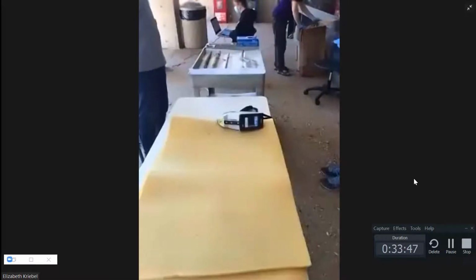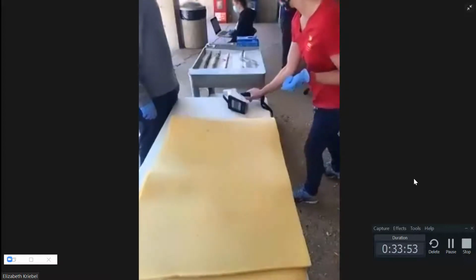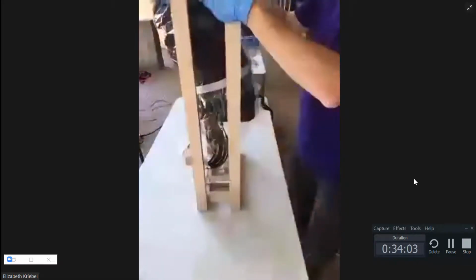Okay, this will be a bit more challenging because it is more fragile. And it's mounted. It's going to be complicated, isn't it? Yeah. So I think we can let go of this. We also don't want to leave this out here too long because of issues of moisture and so forth. Yes, and wind, I'd imagine. So we'll see if we can test it through the cellophane.